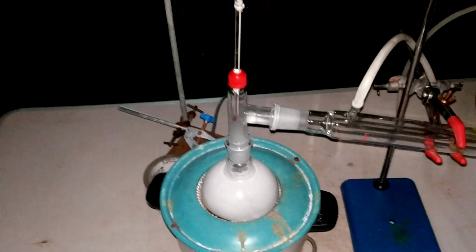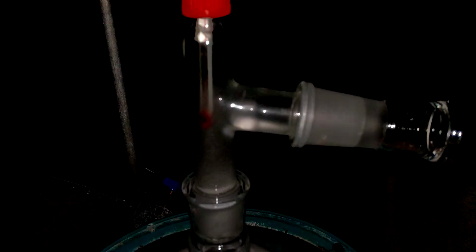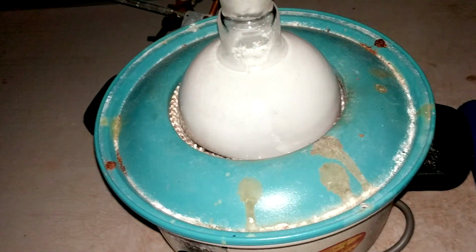Alright, I overshot the mark slightly, as in I was heating it, and we've just got a little bit of our white substance. Ooh, what is that? Niacin distilling over, so that'll contaminate our product, but we have to re-distill anyway, so I'm not too concerned about it.